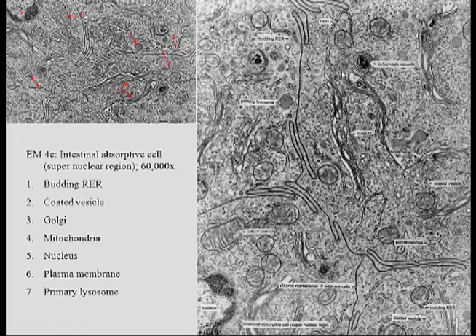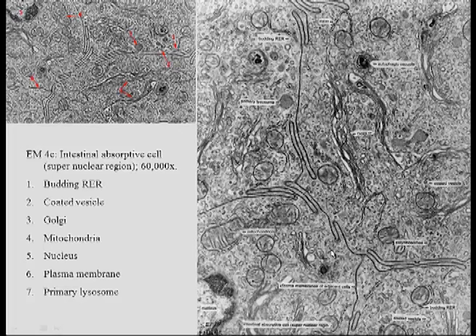microvilli. If you come down from the surface of a cell a little, you see a lot of Golgi apparatuses. One Golgi, there's another Golgi, another Golgi, another Golgi. A Golgi, it looks like a series of pancakes that's been cut. A series of flattened vesicles is what we see with the Golgi apparatus. And these are membranes between two cells. This is actually two membranes, one from that cell and one from this cell, is what we can see.